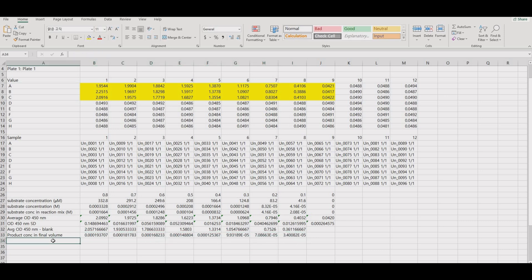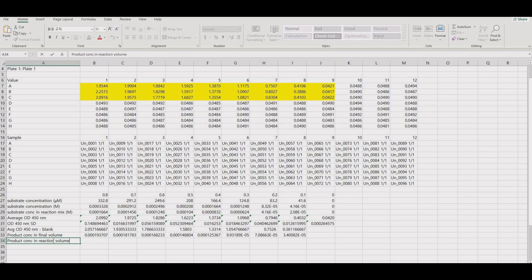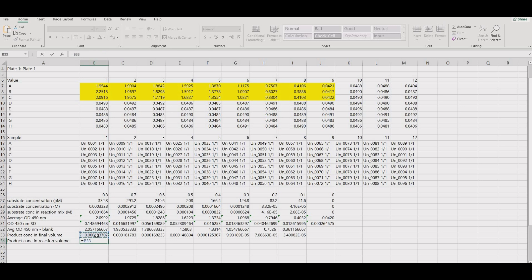The reaction was stopped by adding sulfuric acid and so, effectively, the reaction mix was diluted. The product concentration that was calculated needs to be corrected for the reaction mix by multiplying by 3 over 2.